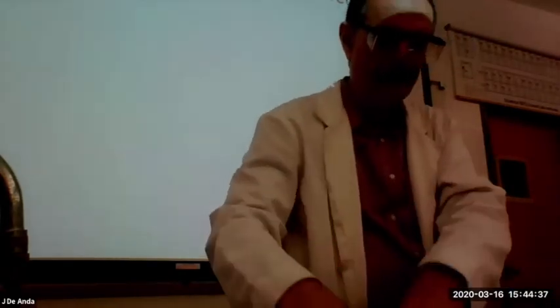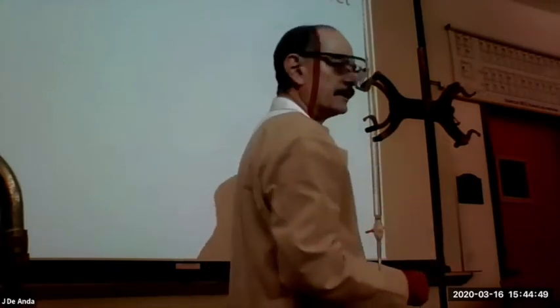So I'm going to put it back on its stand here. And let me move this stuff out of the way so I can roll it over here. I'm recording this, so hopefully people are getting to see what's going on when they watch the video. So here's my burette. Now, let me go back to our presentation. So basically, make sure the burette stopcock is closed, 90 degrees from the body of the burette. Add about 5 to 10 milliliters of your KOH solution.